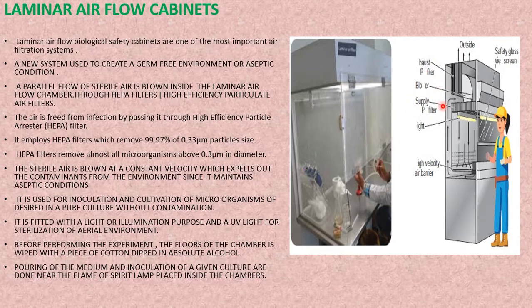Here you will see a filter which supplies filtered air to the inside of the chamber, and it sucks the air from the back and pushes the sterile air inside, and the air that was in the chamber is thrown out.